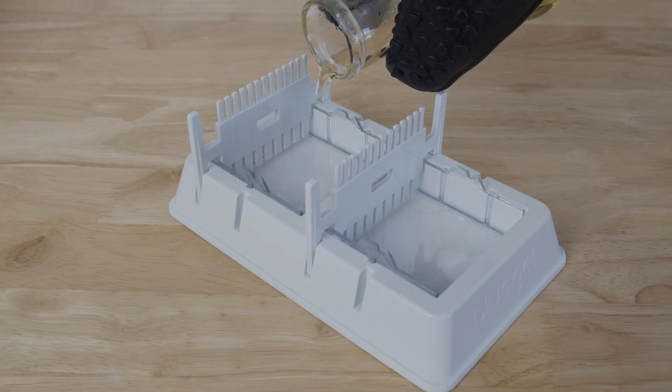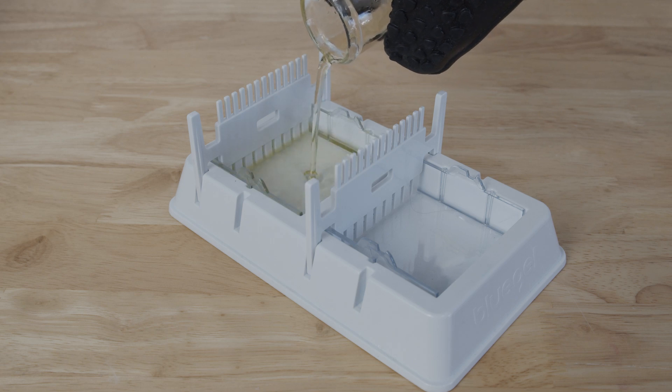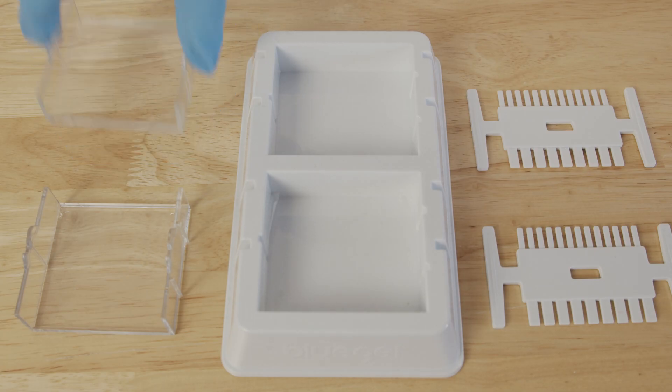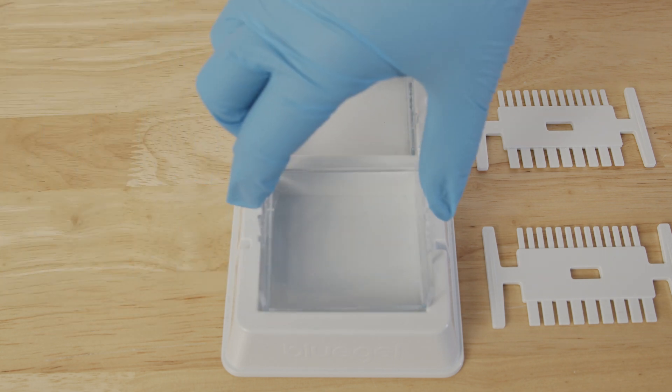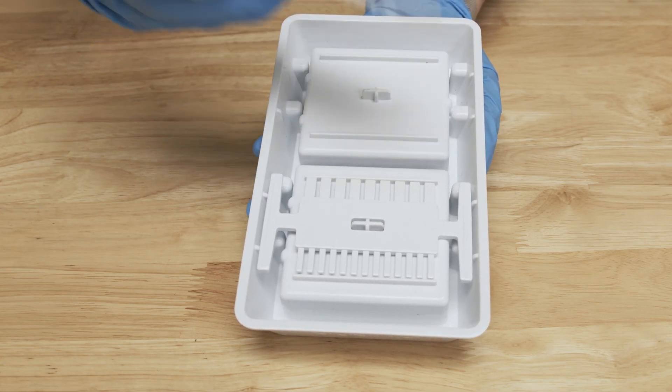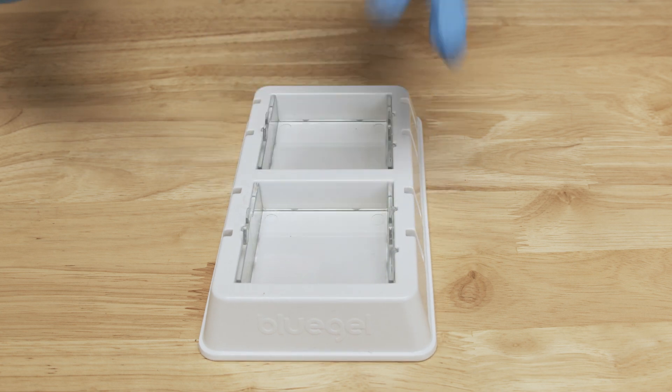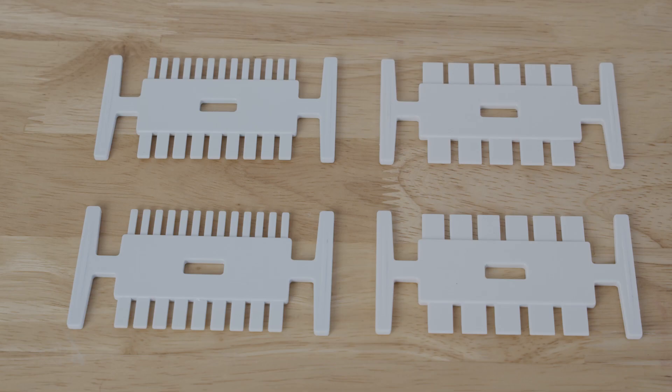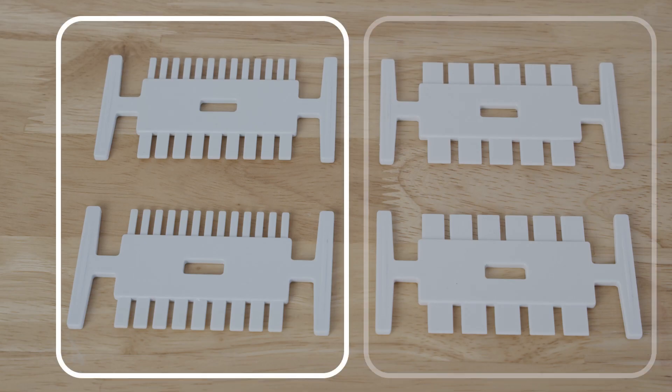To begin, you will need to cast an agarose gel. Your Blue Gel System comes with a white casting platform. The casting platform contains two clear gel trays, and you can store two combs on the bottom. Blue Gel comes with four combs: two with 9 and 13 wells, and two with 5 and 6 wells.